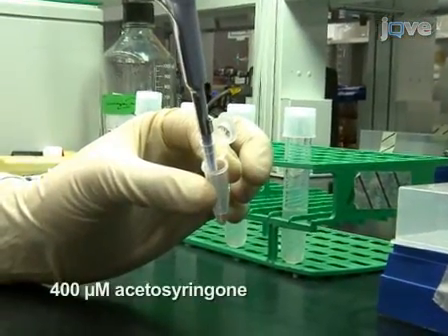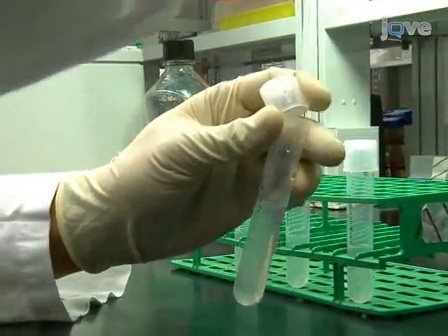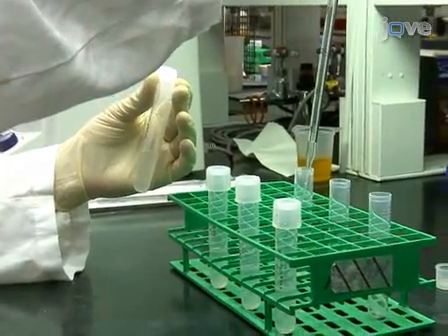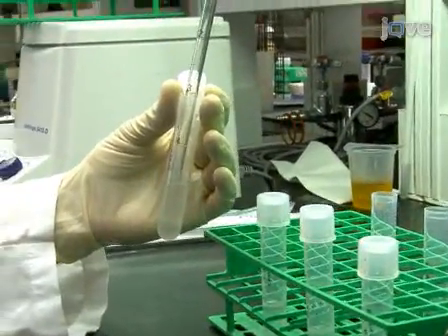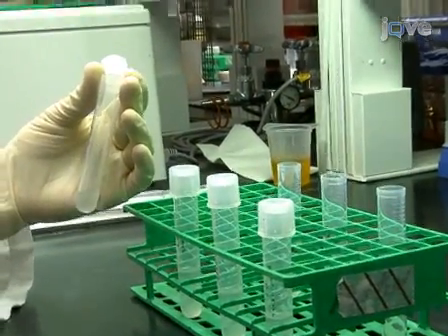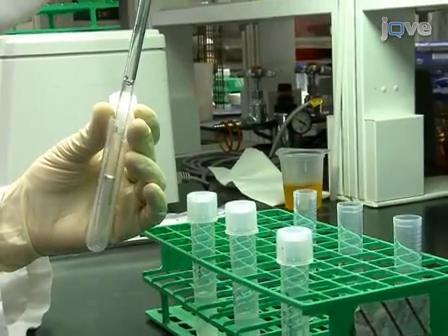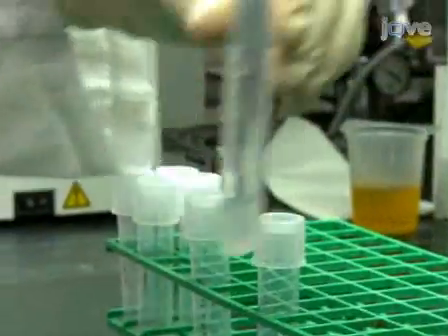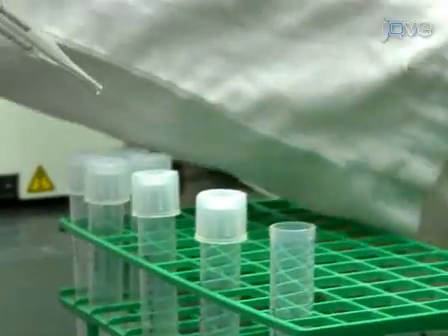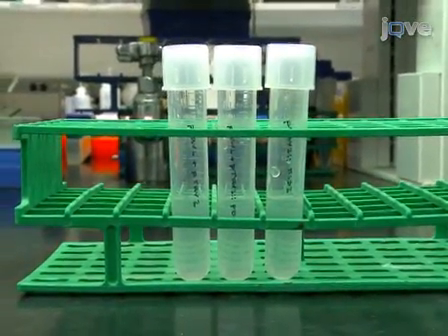Prepare a bacterial suspension with an OD600 of 0.3 for each bacterial culture. Add acetylsyringone to a final concentration of 400 micromolar to the PTRV1 culture. Mix the cultures containing PTRV1 and PTRV2, or the PTRV2 host target gene, in a 1 to 1 ratio. Also include a PTRV2 PDS control. The final acetylsyringone concentration is now 200 micromolar and each culture is at an OD600 of 0.15. The cultures are now ready to be used for viral infiltration of the Nicotiana benthamiana and tomato plants.